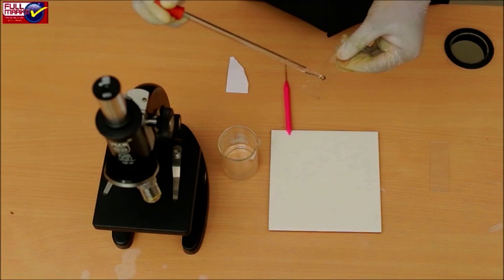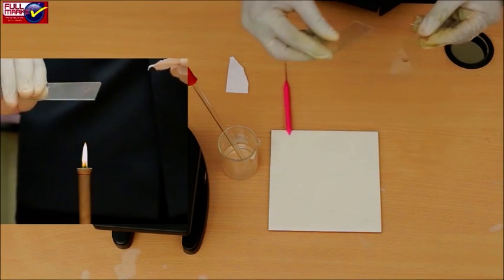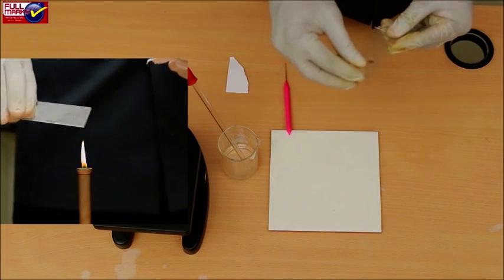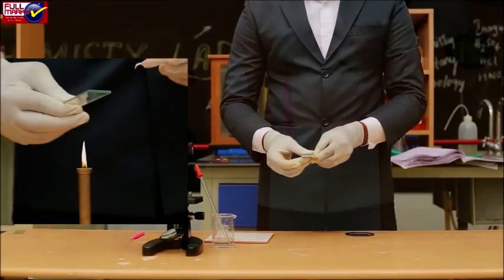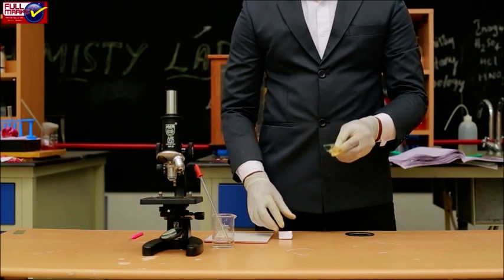Place a cover slip over them and tap it gently with a needle or pencil. Warm it slightly over the flame of the spirit lamp. Put a piece of blotting paper on the cover slip and apply uniform pressure with your thumb.